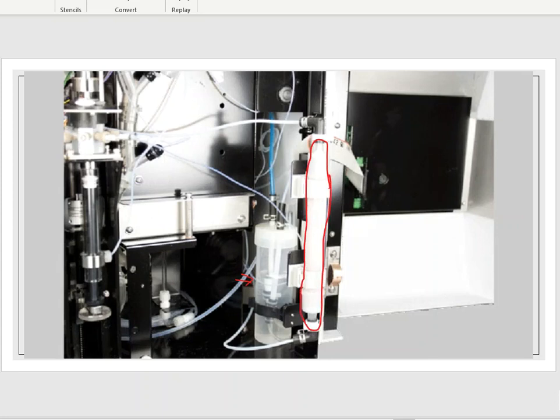It's kind of mounted on its own brackets, and there's a tube, if you've noticed, up here to the top that leads, and a tube down here at the bottom that leads. So this makes sense. If my sample is supposed to go through the halogen scrubber and out the other end into the detector, then I know there's going to be an entry and I know that there's going to be an exit. And if I take a look at the exit and I take a look at the entry point, that also means that this scrubber is going to be very important as far as which way is front and which way is back.